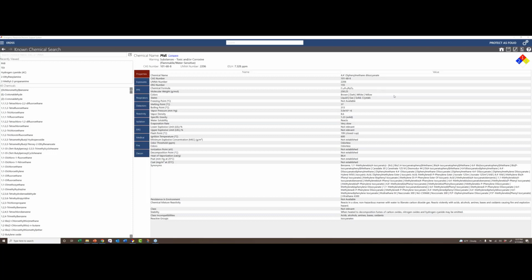And Noel says he sells them too. So, I haven't gone to his website, but it's quickchem.com. And then Derek, thanks. So yeah, also look for the 3-packs. Definitely. You would be shocked when I was trying to buy some on Amazon the other day, the 3-packs were cheaper than the individual. Okay, so just remember that. And I always like to get just a little box of watch glasses so that when you want to do any of those different things, you can go ahead and do that in the field.